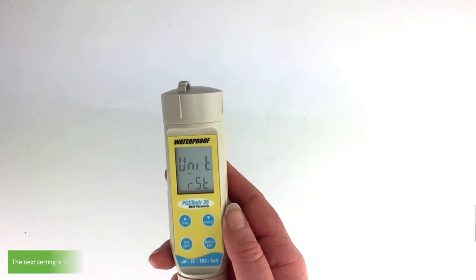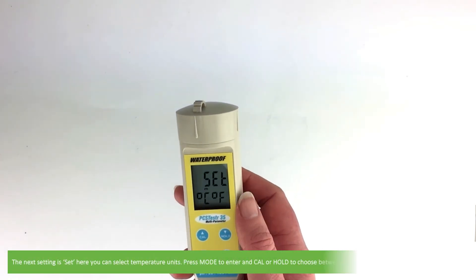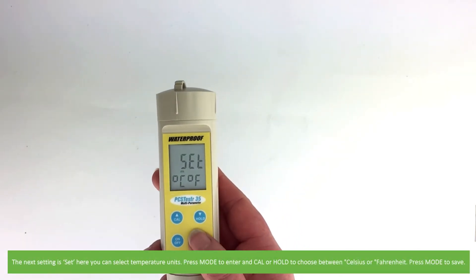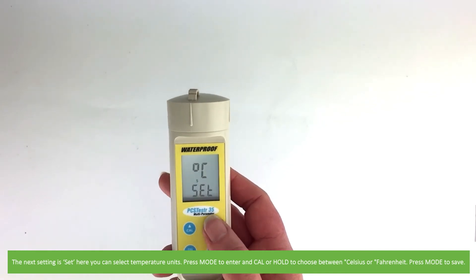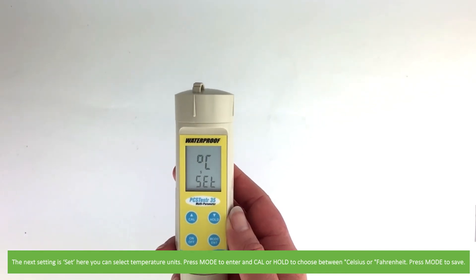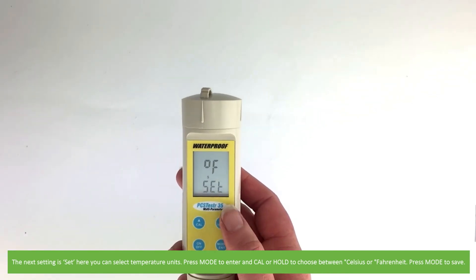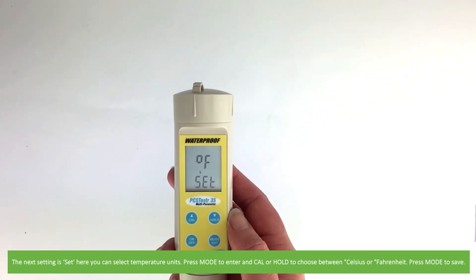The next setting is set, where you can select temperature units. Press mode to enter. Use cal or hold to choose between Celsius and Fahrenheit, then press mode again to save.